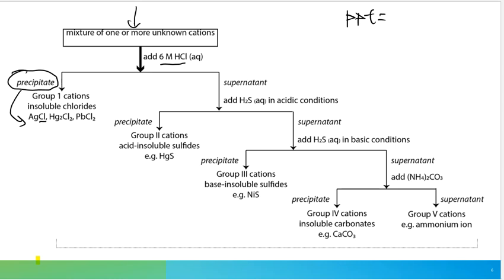Hence, when we look at the hydrochloric acid monograph, the identification test for chloride is going to say add acid, and if chloride is present, add silver nitrate.